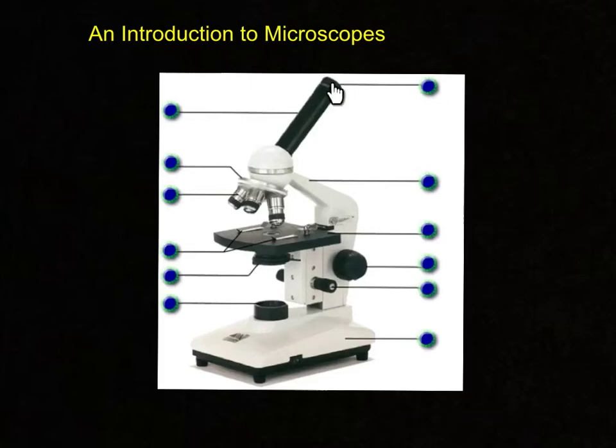Along those lines, inside the eyepiece, one of the things that you'll see is that there's usually an arrow, and as you look through that, it helps to point out specific areas that you have located in your slide or specimen that you have attached to the stage clips.